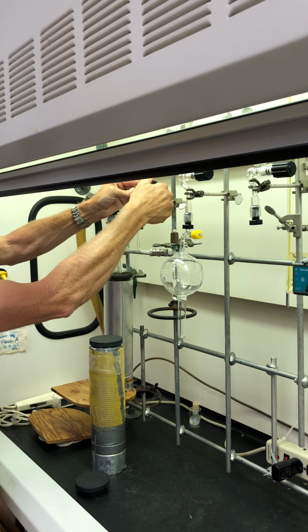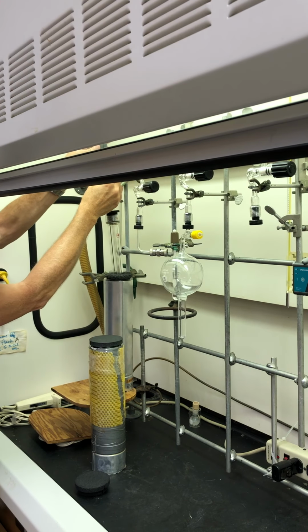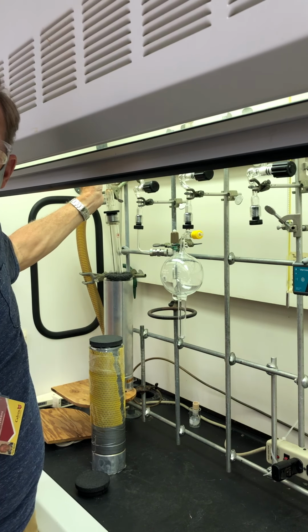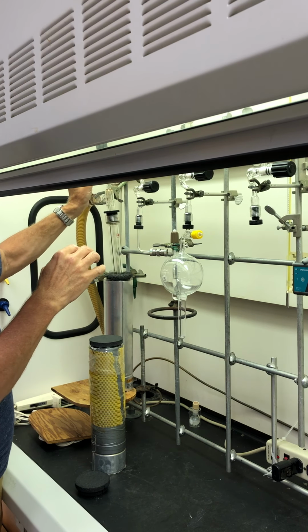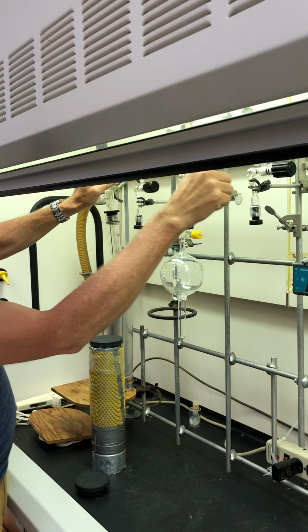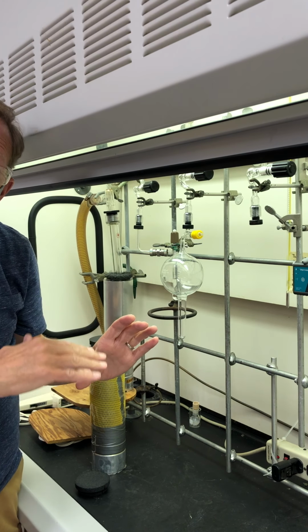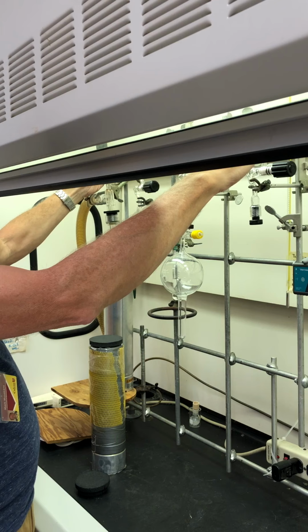I'm using two hands. One holds the barrel and the other turns the knob. So I see O-rings here, those are all closed. And now I can open this valve, the main valve. I lift that up by turning it, and there are seals in there. You just want to be sure that those seals stay in contact with the barrel. And here we can see that this lowest seal on the main valve is halfway up the scale. That means it's pumped all the way down in this main part. And then our sensor, once we have it connected to our phone, will give us a reading of the pressure, and you'll get a sense of when that's at the lowest value you can get. So that's how you open up the valve to start pumping things out.